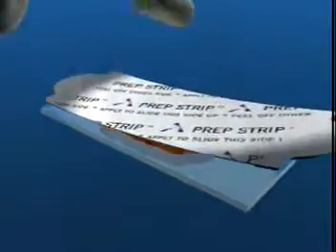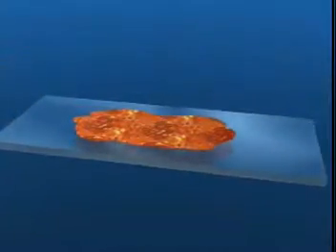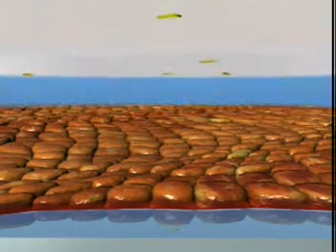To perform a micro dissection, prepare the tissue by placing a prep strip on the tissue sample and gently pressing with a gloved finger. Made of non-adhesive polymer, the prep strip evens out any variability in tissue topography and removes loosely bound particulates.